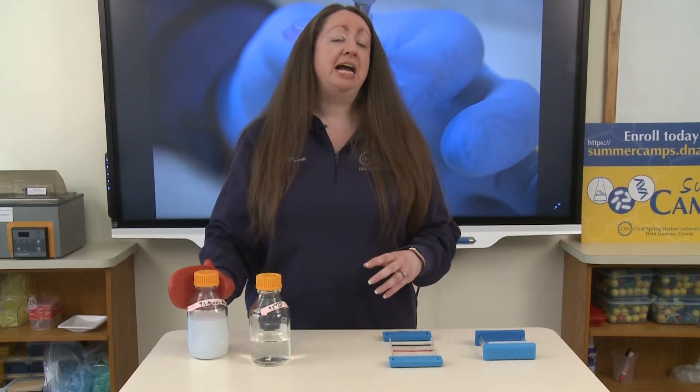That spider web allows DNA fragments of different sizes to migrate through the gel. Smaller fragments can run further through the agarose gel, while larger fragments have a harder time running through the gel matrix and stay further behind.